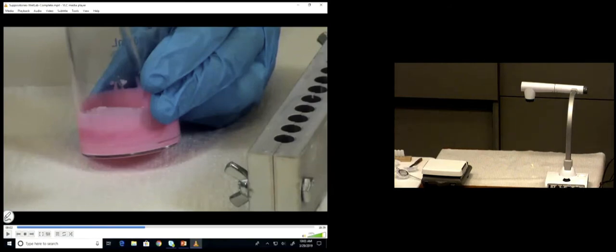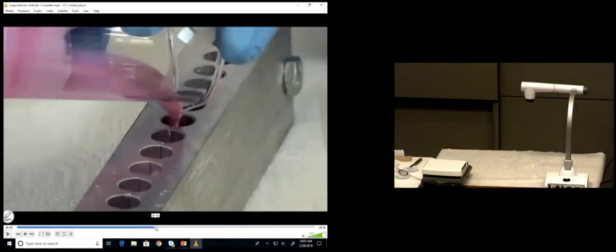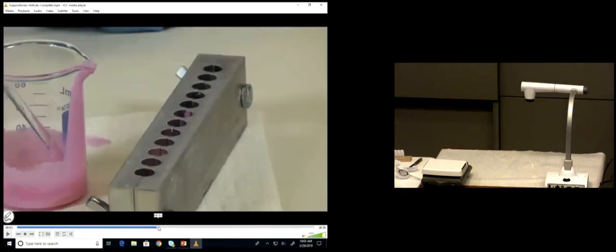So you take this pink drug, and in the video, yours will be blue, back and forth across 10 cavities that all remain as low as possible. You want them evenly dispersed, but below the level of the cavity, okay? So you can see here, she's going through and pouring, but none of them are getting to the top, okay?